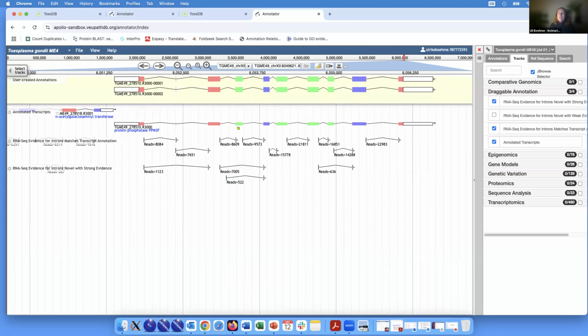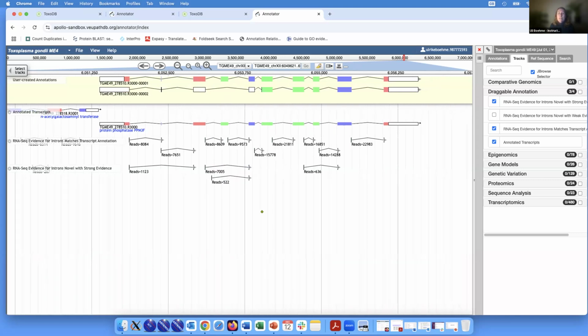And then we've decided that there is an exon skip. This is this intron here. And you can actually click on these introns, and then you can see here with the red border where they are. And it clearly says this exon needs to be deleted here. So let's delete it. And let's see what comes out the other end. And as David already said in his demo, we will get a much shorter CDS, but probably valid. This has now a longer UTR, but here a much shorter CDS.